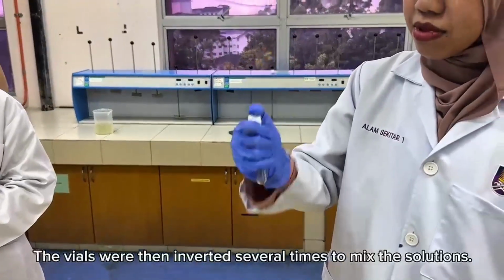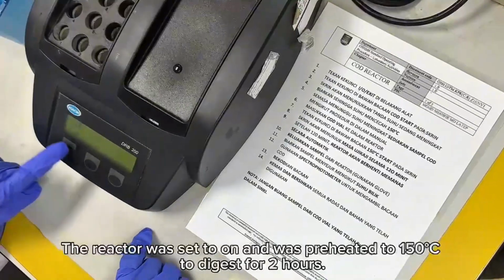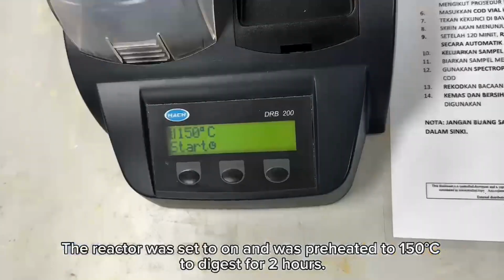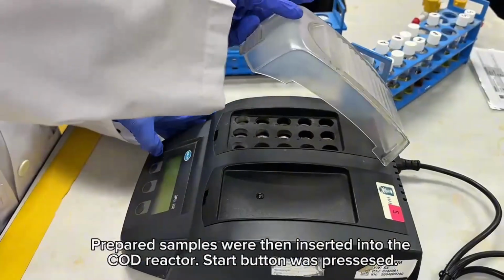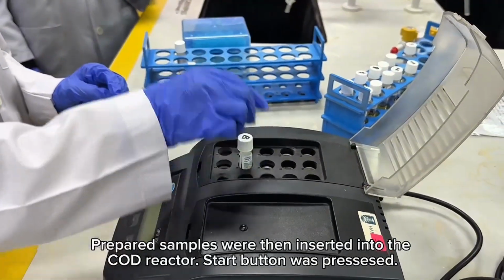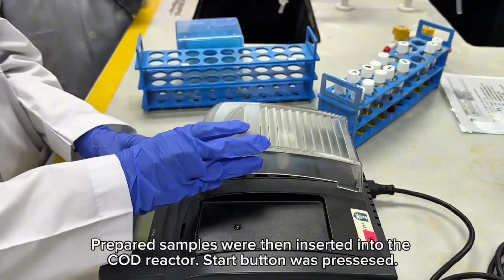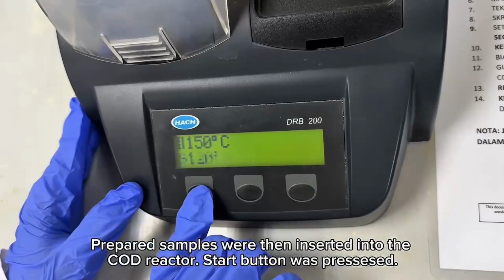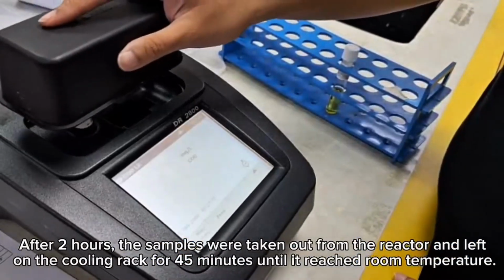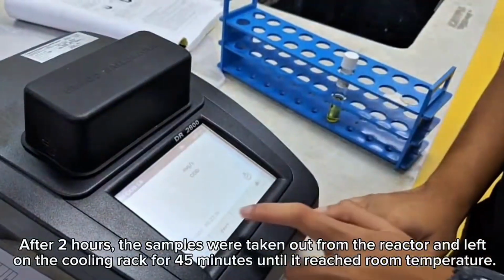The vials were then inverted several times to mix the solutions. The reactor was switched on and preheated to 150 degrees Celsius to digest for 2 hours. Prepared samples were then inserted into the COD reactor. The start button was pressed. After 2 hours, the samples were taken out from the reactor and left on the cooling rack for 45 minutes until they reached room temperature.